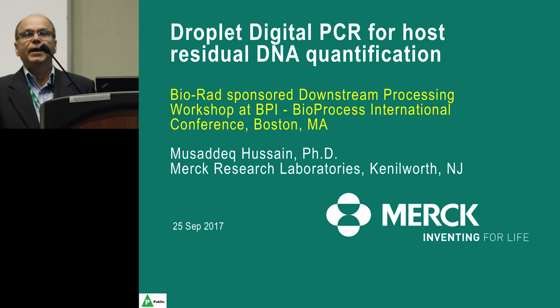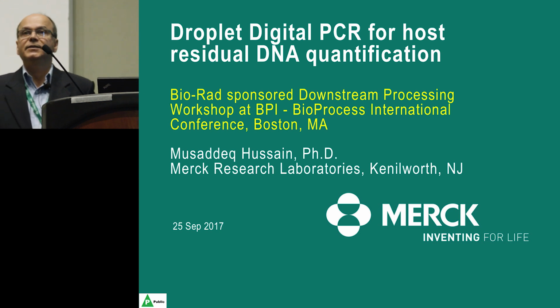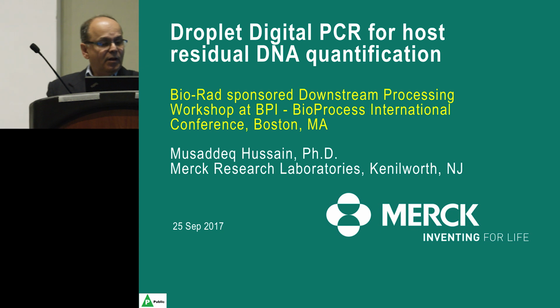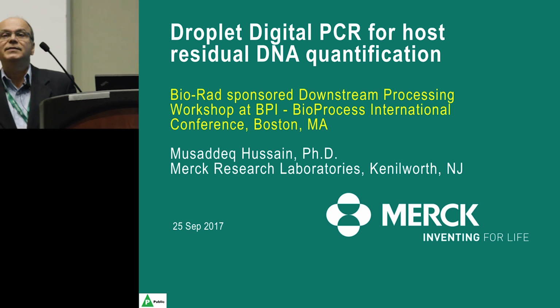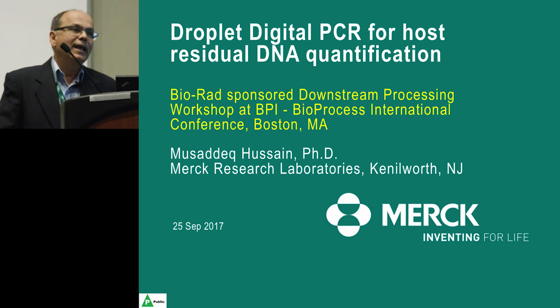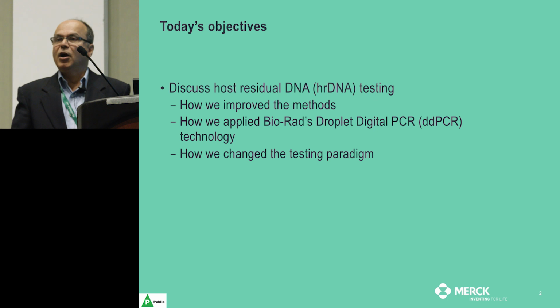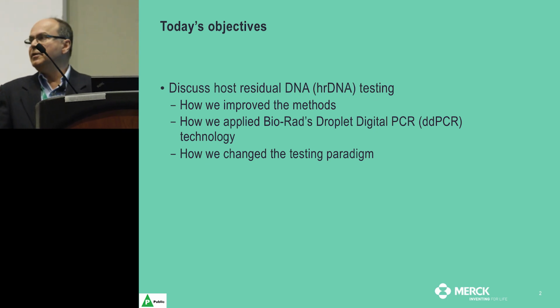I am going to talk about host residual DNA analysis methods. Why? Because it's one of the release tests for a drug, and there are regulatory requirements for allowable limit or recommended limit of DNA in the drug.